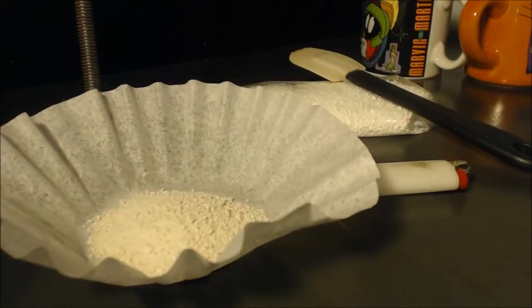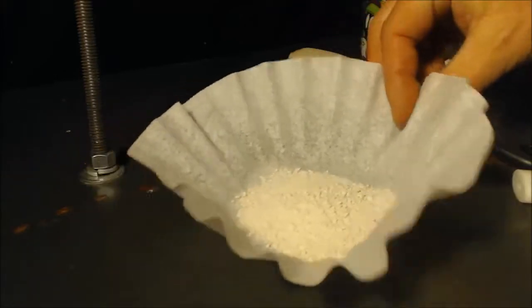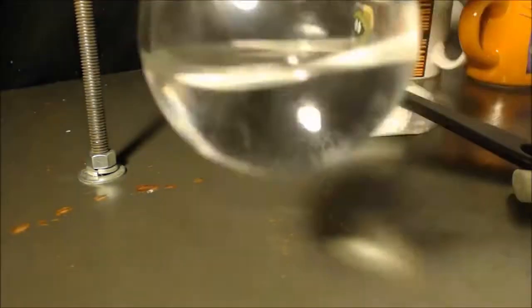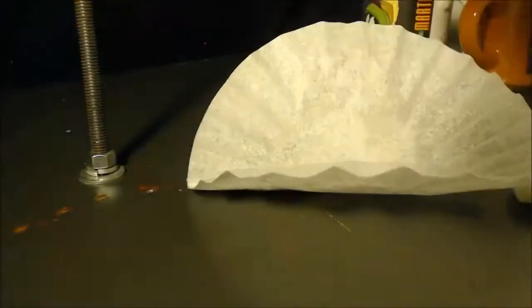But anyways, I'm going to put them together. I only have 100 milliliters, so I only took half of my yield here. So I only have 14 grams here instead of 28. Well, I don't see a biphasic mixture coming about, but you never know. That would ruin it because then the potassium acetate would just go into that water part. You know what I mean? We don't want that. We want it to stay in the ethanol.